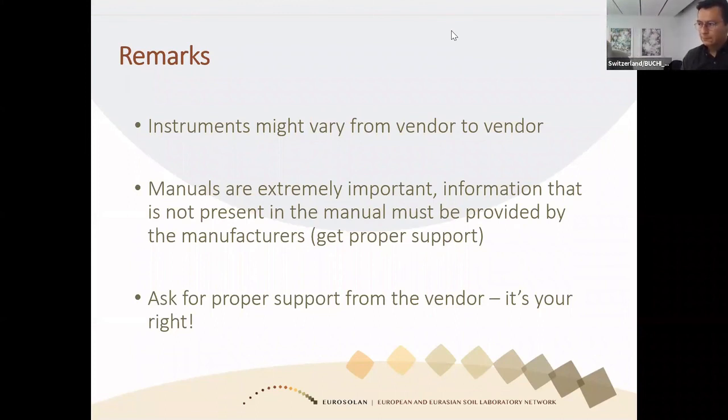Yes, which is one of the things that, although Dumas is quite convenient, much easier, let's say, than Kjeldahl, since Kjeldahl has a lot more chemicals, Kjeldahl allows for higher amounts of sample to be analyzed. With more sample, you may capture more information. Kjeldahl is up to 10 grams of sample, whereas Dumas is 1 gram.